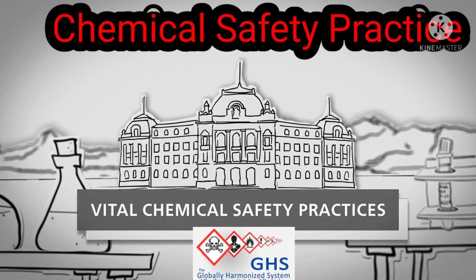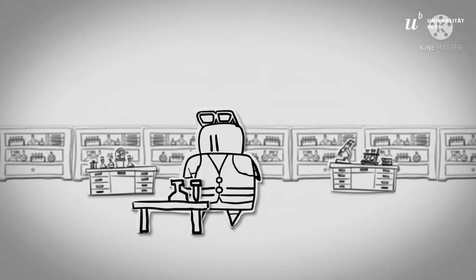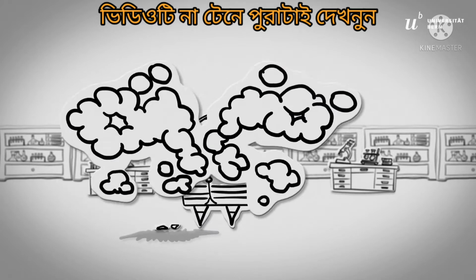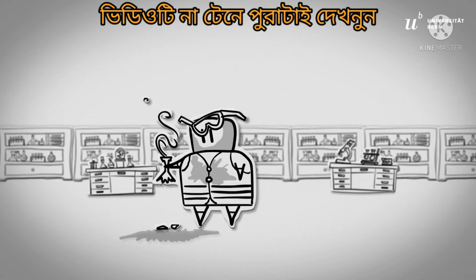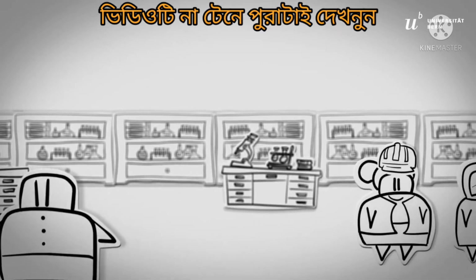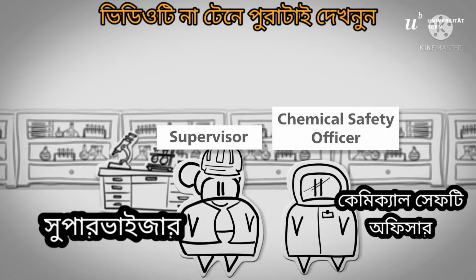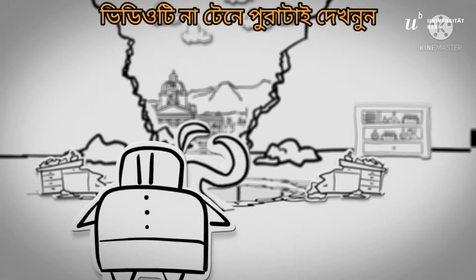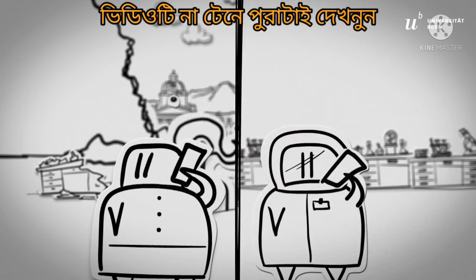Vital chemical safety practices. Working with chemicals comes with certain risks. You can minimize the risks at our university by following these safety practices. First, you should know that besides your supervisor, there is a chemical safety officer in your department. Before any activity with chemicals, you must contact them for a risk assessment and instructions.